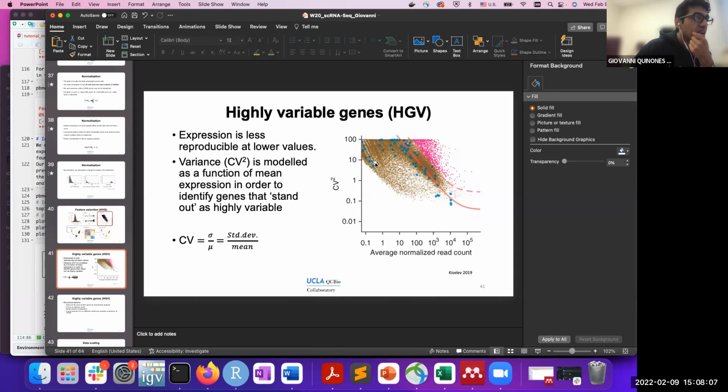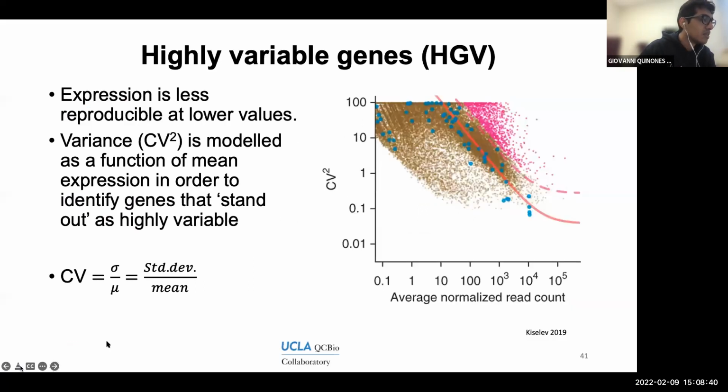And then all the dots that are more to the left over here, meaning this area over here, is what is representing pretty much all the data points that are not fitting too well with our distribution. The conclusion is that this will be more likely due to some technical error.